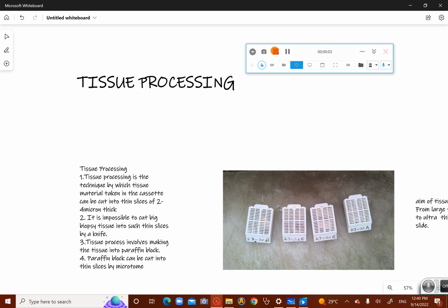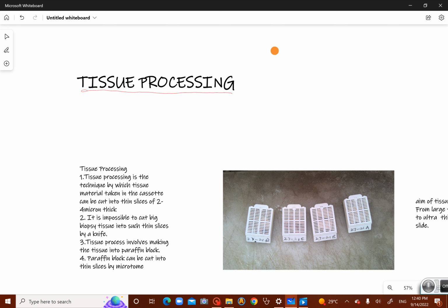Bismillahirrahmanirrahim. This video follows the video regarding grossing of a specimen, and in this we are going to discuss what is known as tissue processing. Tissue processing. Now, what is tissue processing?